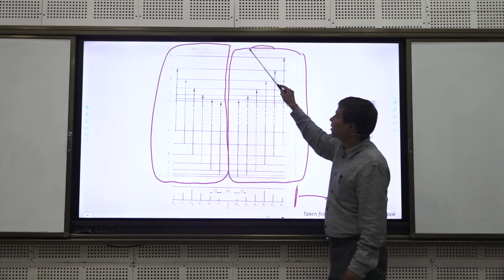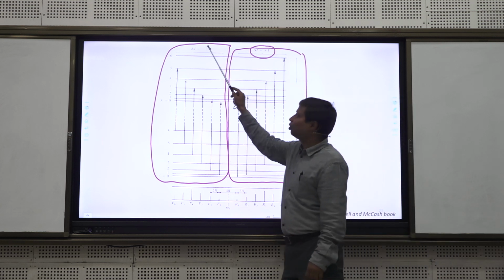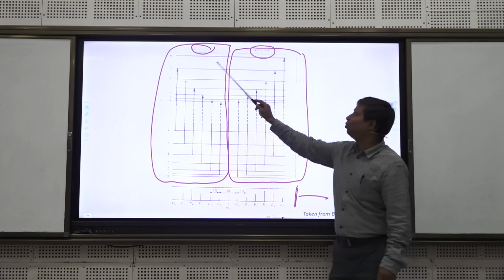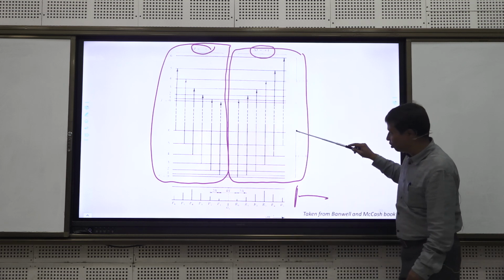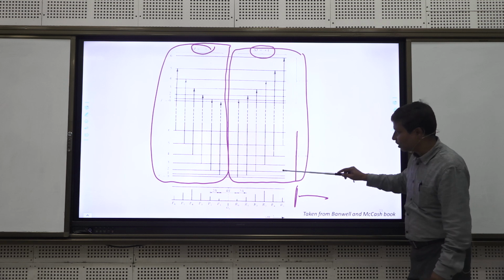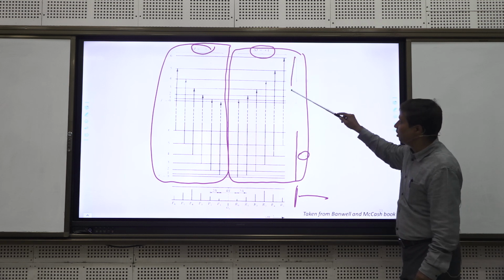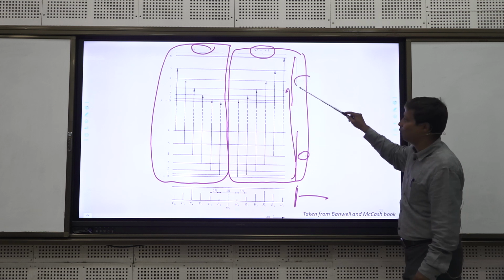One part talks about the delta J plus 1 transition, and another part talks about the delta J minus 1 transition. One is minus 1, one is plus 1. These are transitions between the rotational energy levels under V equal to 0 and those under V equal to 1.